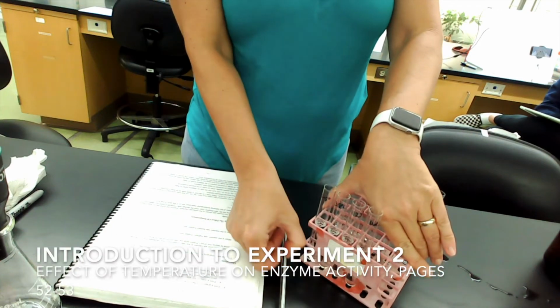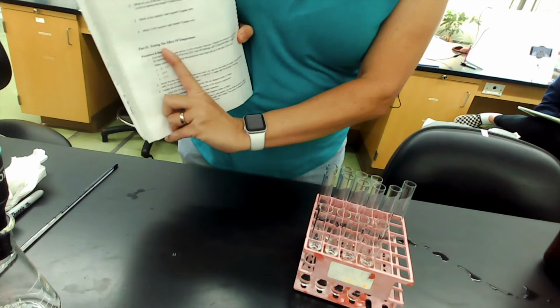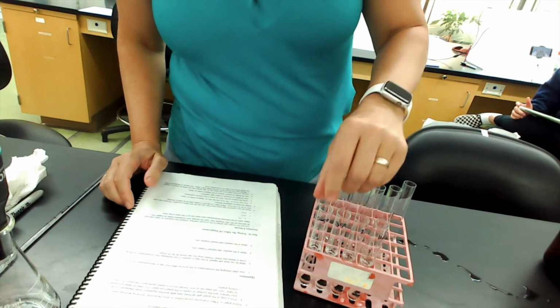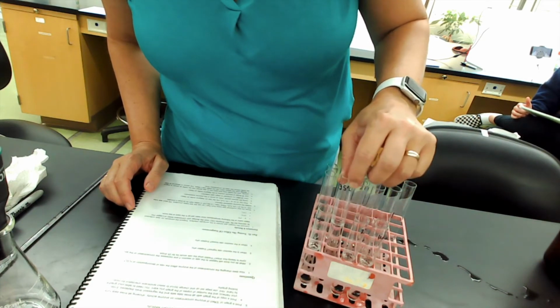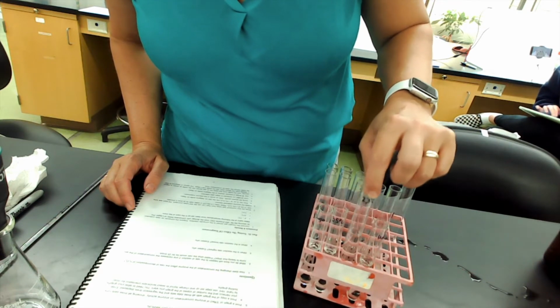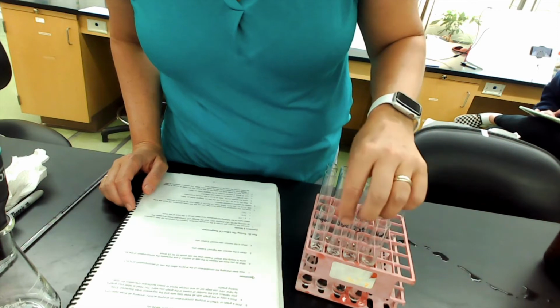Okay, for the next set of reactions, or part 2, we're going to test the effect that changing temperature will have on our reaction rate. So I have one tube that's going to be at 0 to 5 degrees, one at 35, one at room temperature, which I measured at 23 degrees, and one I'm just calling hot for now until I figure out how hot it's going to be.